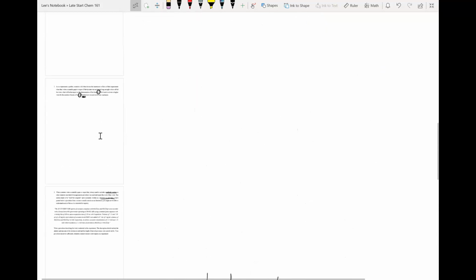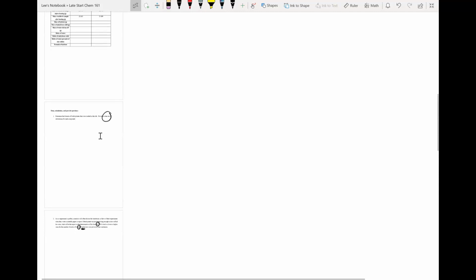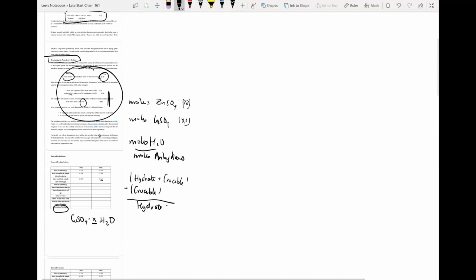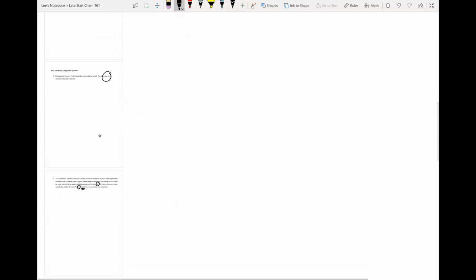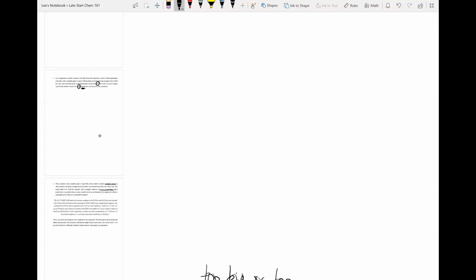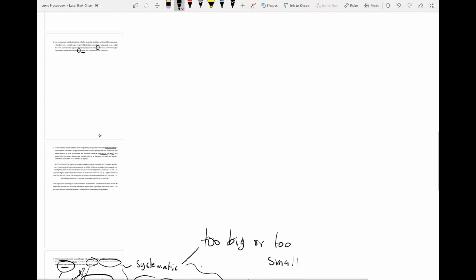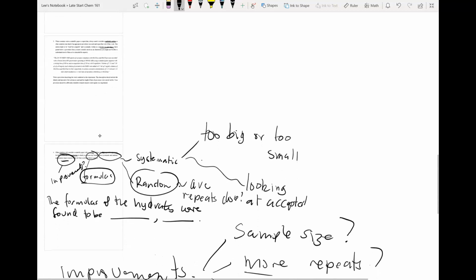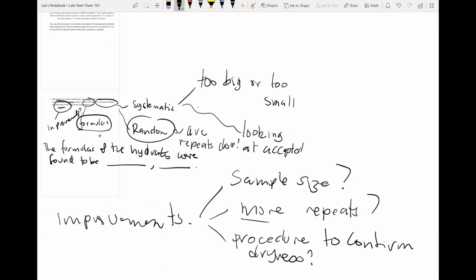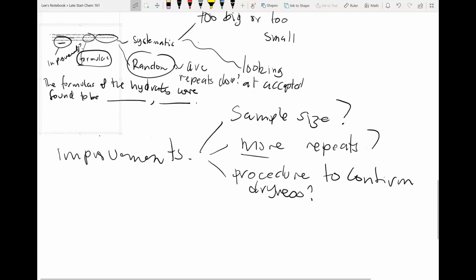So that's really the lab. There's only the 4 questions there, I think, and the first one is just showing your work. Remember, you've got an example calculation up here for calcium chloride, and you just got to follow that through for your 2 examples, and you'll be fine. Yeah, a set of calculations, and then you're going to do a reflection upon what would happen if a certain sort of mistake was made. How would that affect your results? And then we're going to do the method section, which I basically gave you, and then you're going to write the conclusion. And as long as you hit all of the points that you're asked for there, then you're probably going to get good scores for your conclusion as well.